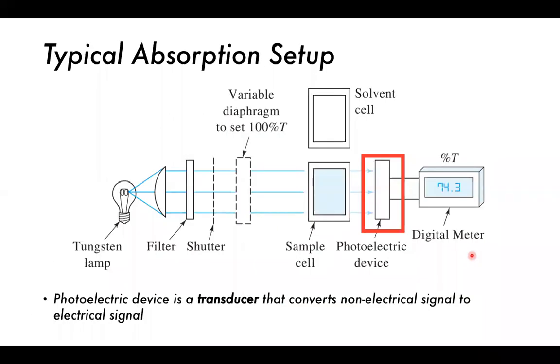Okay, so that was a sample cell holder. So typically for UV vis measurements, you want to be using either plastic, glass, or quartz. Quartz is the best, but expensive. So glass is usually where you reach a compromise. Plastic is really only for very specific instances.